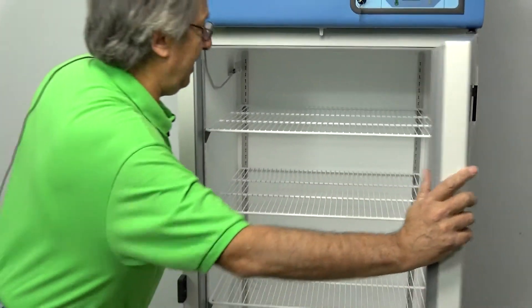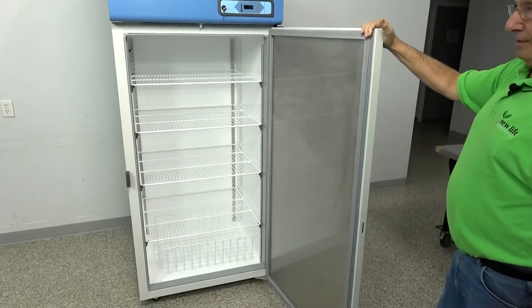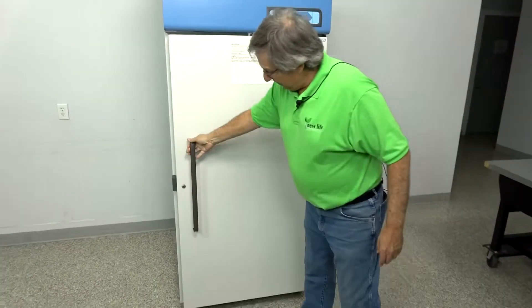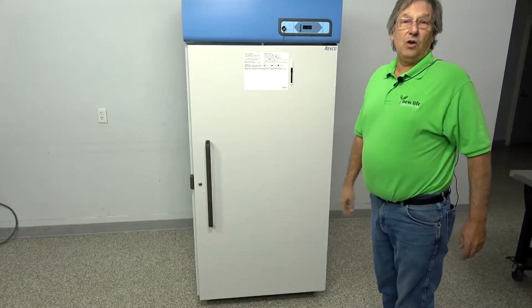It's an ultra huge size, 29.2 cubic feet, four adjustable shelves. This one isn't going to last long, folks. It also includes a lock so that you can lock the door as well as your alarm settings.